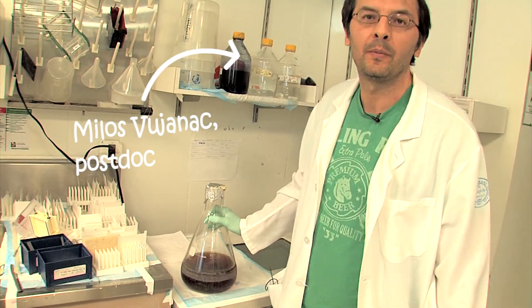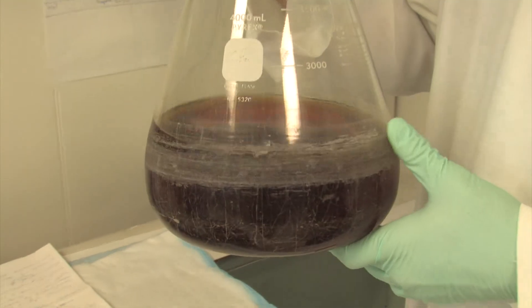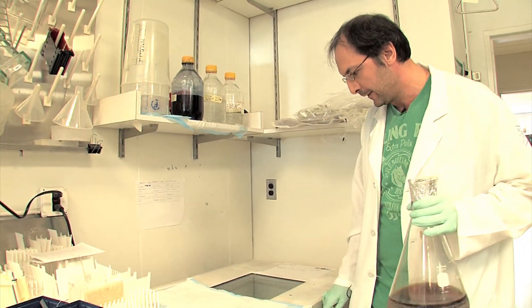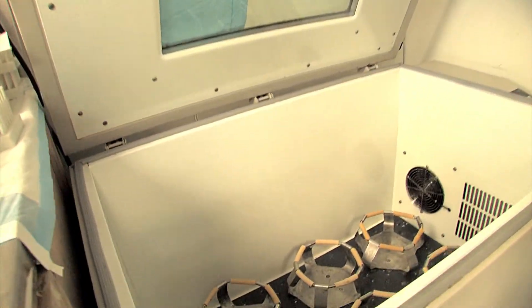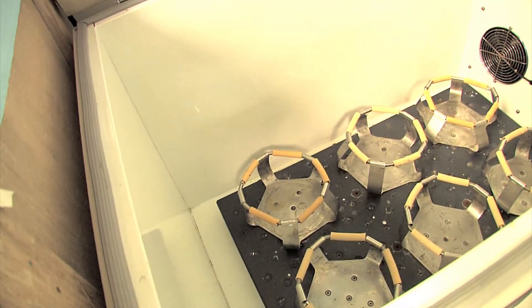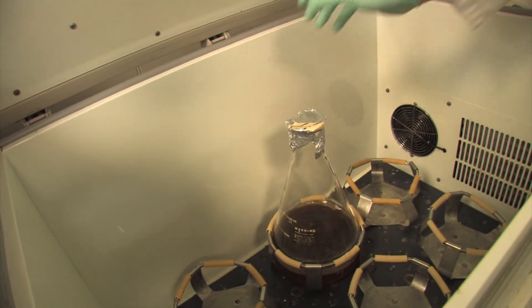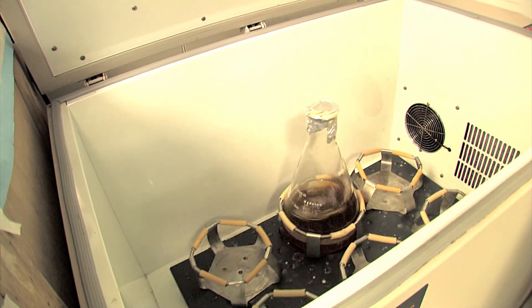So we generally grow bacteria in the liquid medium, which is called LB growth. This is a very rich medium, which contains all the nutrients necessary to grow bacteria to a very high density under optimal conditions. So we use these incubators here. These incubators can take up to 12 liters of bacterial culture. So in these shakers, we set up the optimal temperature for bacterial growth, which is 37 degrees, and agitation of around 250 RPMs per minute.